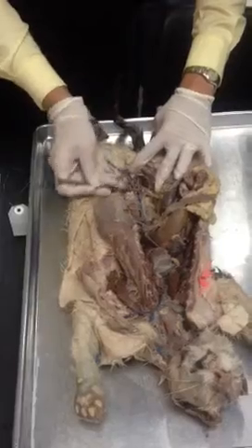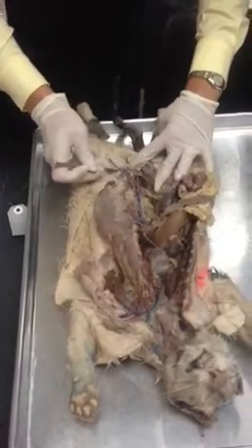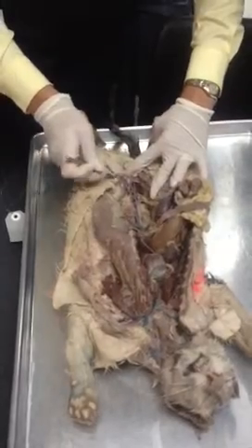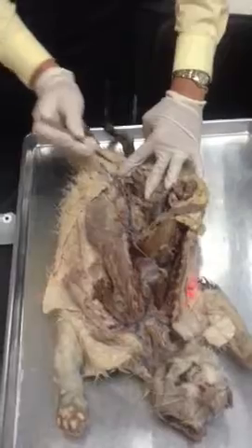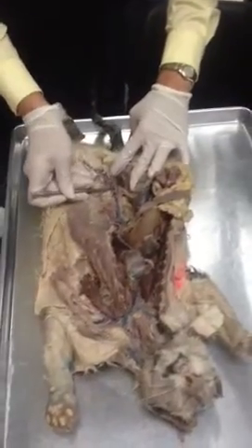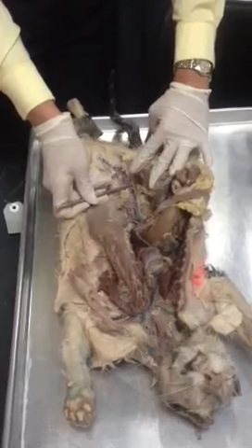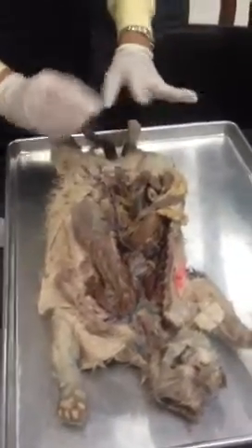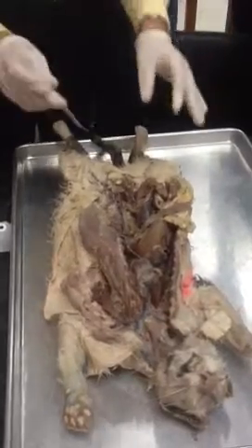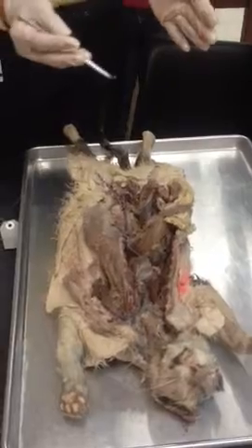And then here we have, this will be external iliac, and you see that it continues right here as the femoral. Right, femoral, and that's where we stopped the dissection. We didn't go any further. And here, this one, the smaller one, and little more caudally, that would be the internal iliac artery. Those are arteries.